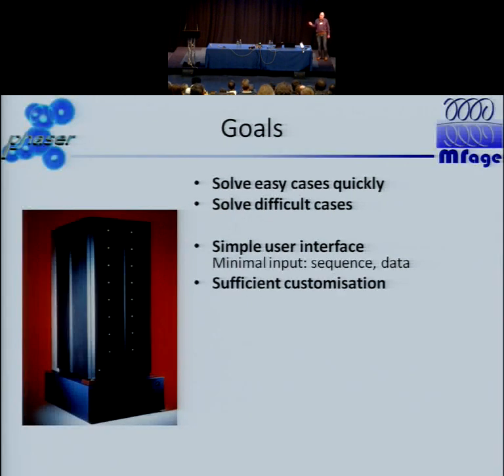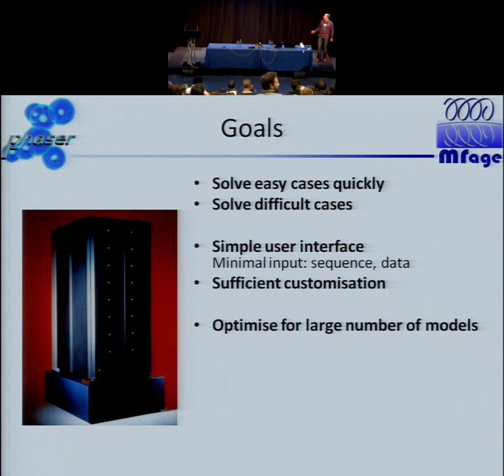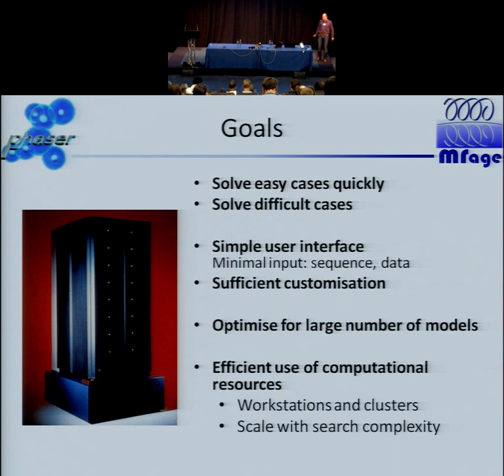However, we allow sufficient customization, so really you can do whatever you like. And I will just show how this works. Since this is a de novo solution for structures, we are optimizing the calculations for a large number of models. And we also want to make efficient use of the computational resources that are available. This is something I'm going to talk about on the next slide.